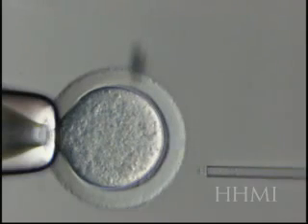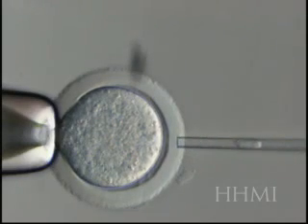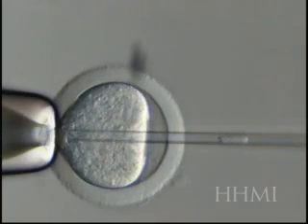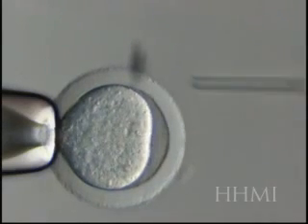Here we'll see it again: a little hole, and the zona is prepared, and now the nucleus is going to be squirted inside. So there are two examples of what's called somatic cell nuclear transfer.